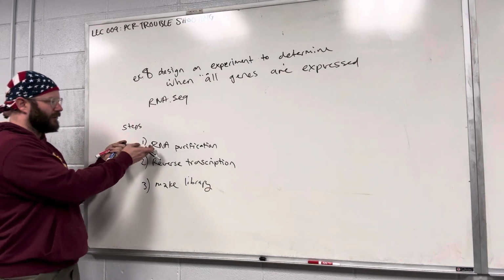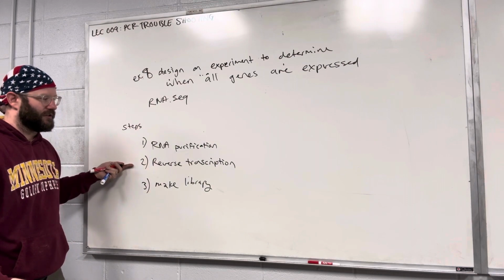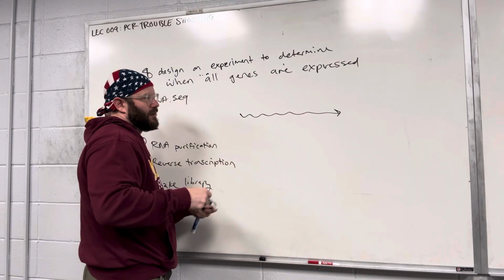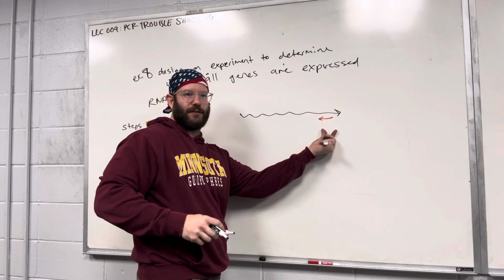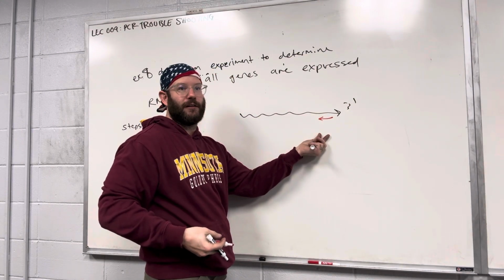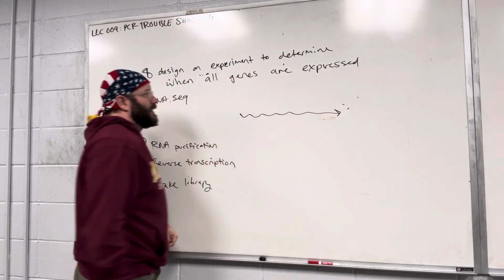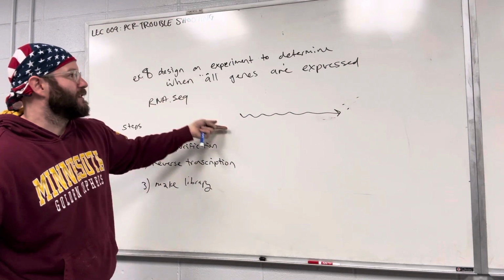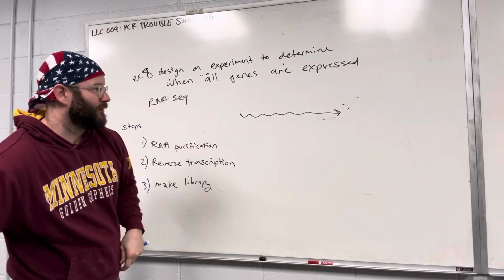So you would still do an RNA purification of global RNA. You do reverse transcription reactions, but the difference between RT-PCR and RNA-seq is that in RT-PCR, you designed a specific primer that bound to the 3' end of your vitellogenin gene, which you were targeting. You were looking at a specific gene. In this case, you want to look at all genes. So what kind of primers do you need to be able to make cDNA from all possible genes?